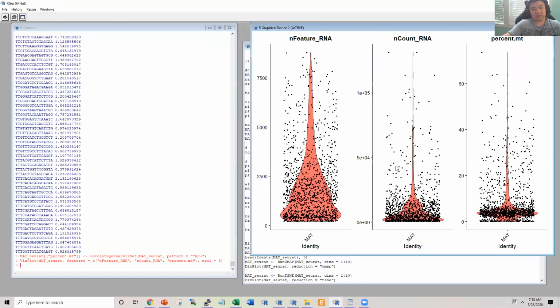Here are the total counts of RNAs. So certain cells are with extremely high expression. This is highly common because this is the Drop-seq genomics data. When we construct the libraries, all the reads are put together, and the reads from certain cells can be drawn more frequently. So this results in a biased total number of counts from different cells.